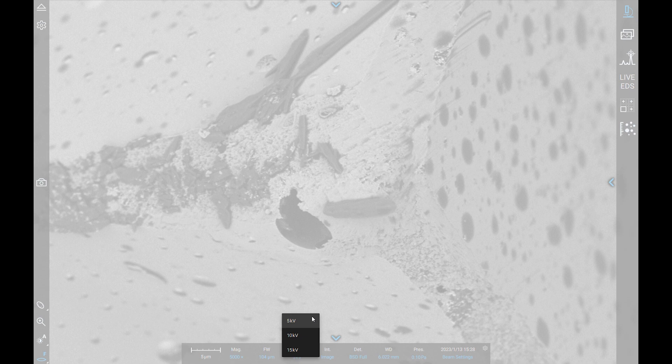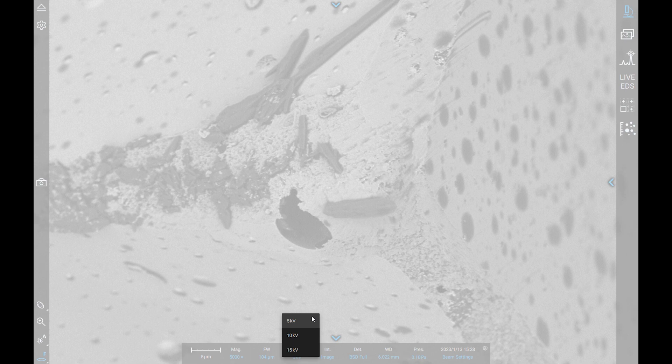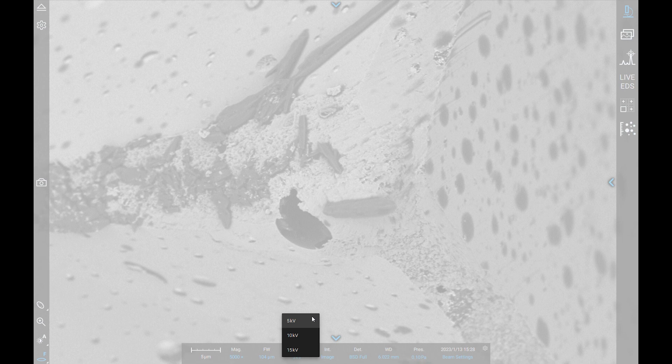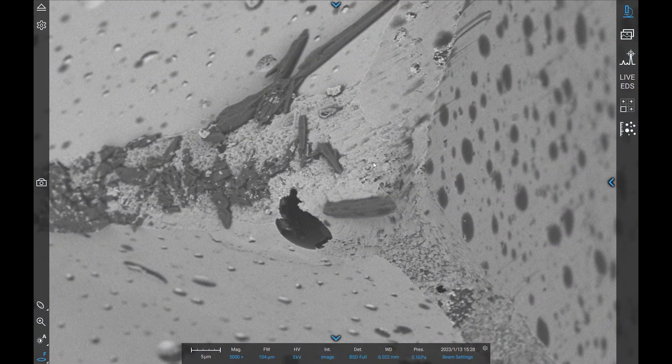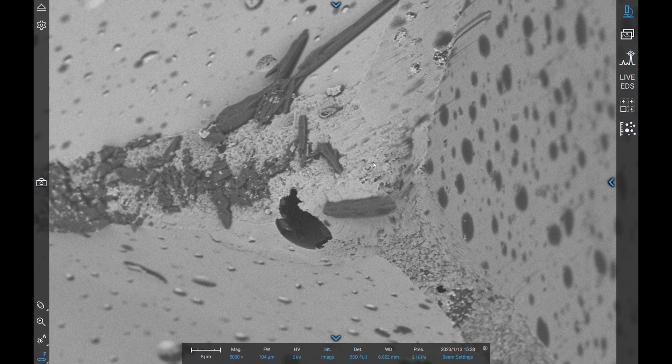5 kV is the lowest standard accelerating voltage. 5 kV does not penetrate deeply into the sample surface, so it provides great surficial information. 5 kV is great for imaging delicate samples or the shallow surface of samples, much like this piece of sandpaper.